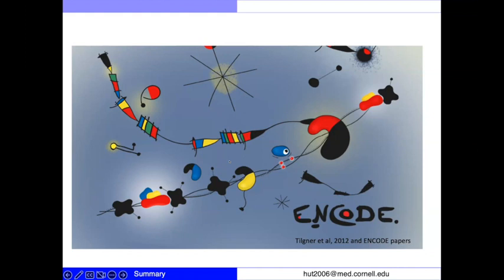That means, when we ask for co-occurrence of distinct isoforms for very highly expressed genes, we do observe this. There are a couple of examples where that is the case. And there are also a couple of highly expressed genes where you can say there's actually very little co-occurrence of multiple isoforms. But for most genes, the ones that are not super highly expressed, we can't really make that statement, which is more a limitation of throughput, meaning UMIs per cell, rather than a biological statement.